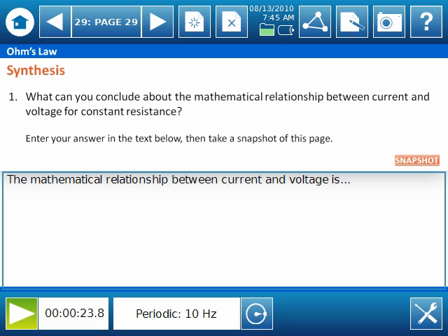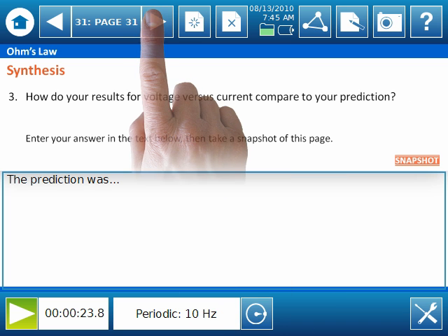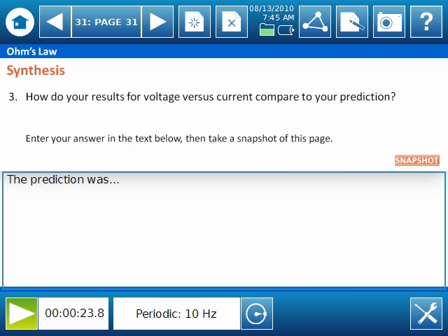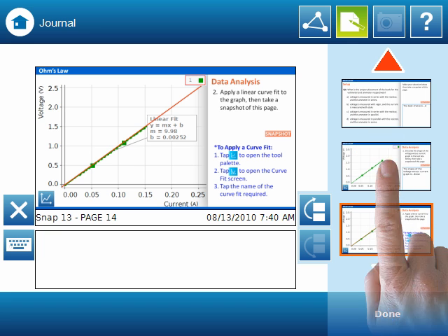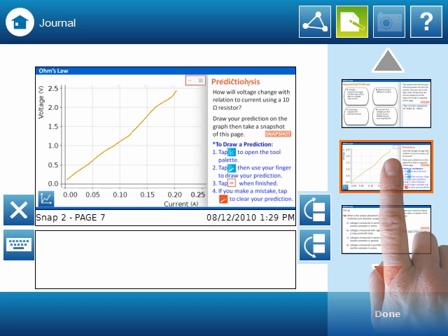The synthesis questions summarize and relate the lab experience back to classroom learning and real world experience. They also give students a chance to compare their predictions to their actual data. To do that, let's use the journal. If we wanted to compare our actual data to our prediction, we can do that here.